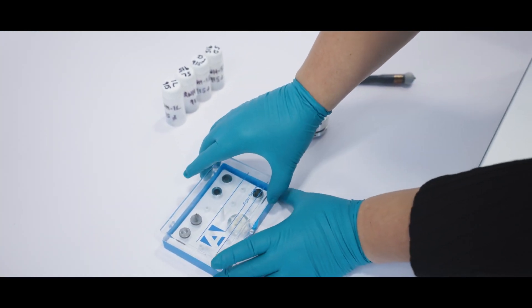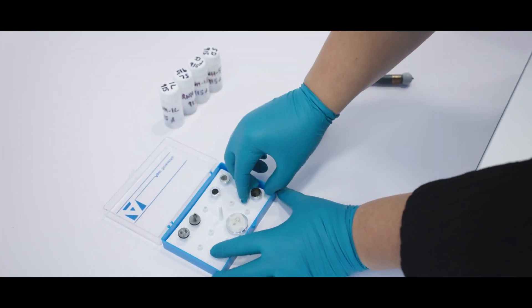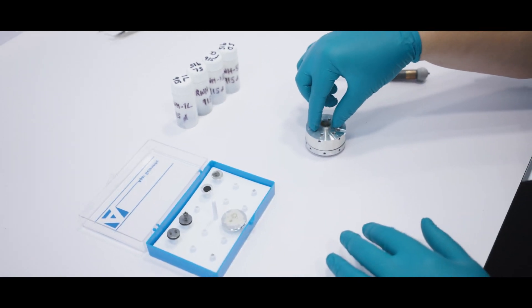These are powdered samples that have been leached in either deionized water or in a groundwater simulant. What's very interesting is the chemical complexities that form at the surface and the alteration layers that form, and how the glass behaves when it's been leached in water for so long.